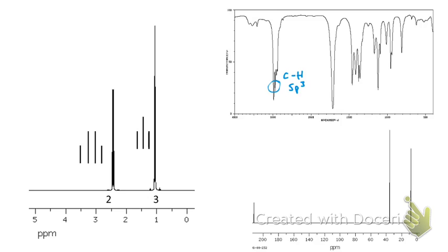I don't know what happened. Whoever downloaded the spectrum did not look carefully at the background information on where it came from. Oh, there was a secondary solvent added. Okay, that secondary solvent gives you the CH3 signals. It's not actually in the spectrum, just the alcohol. The alcohol is true, and you should be able to identify another signal that works.